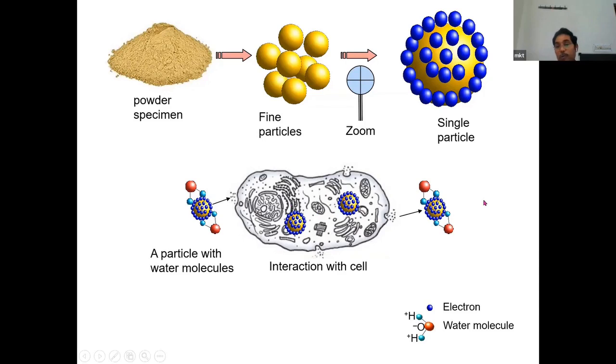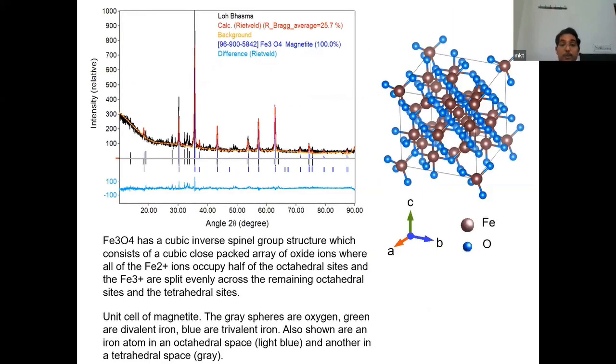Finally, they come out of the body, and this has already been proved by some of our colleagues in the RC. They proved that some Ayurvedic medicines given to patients came out of the body, by analysis of urine samples. To confirm what is happening, we took the iron bhasma from the Ministry of Ayush. First we did X-ray diffraction analysis.